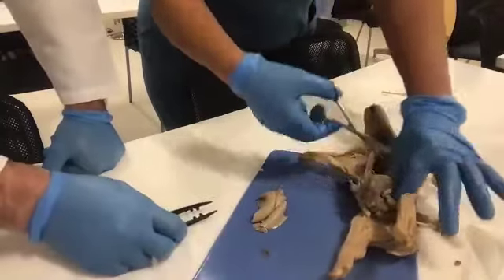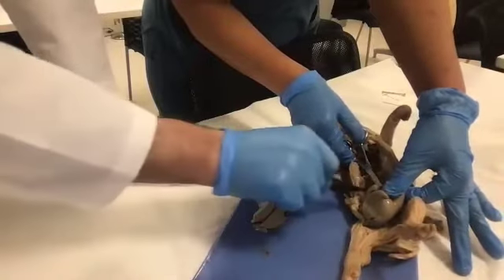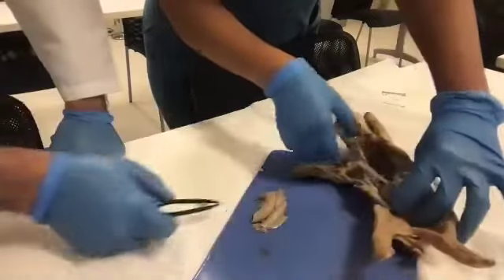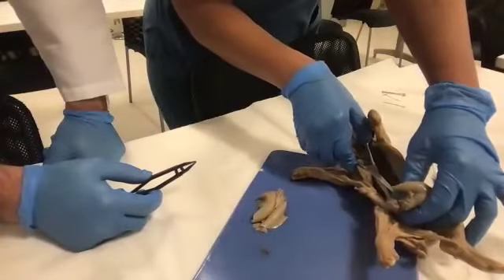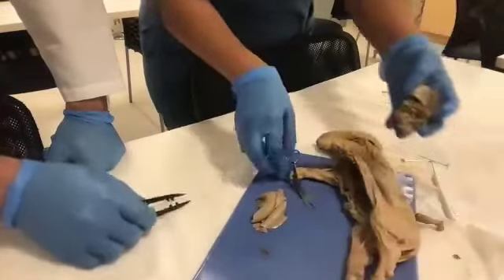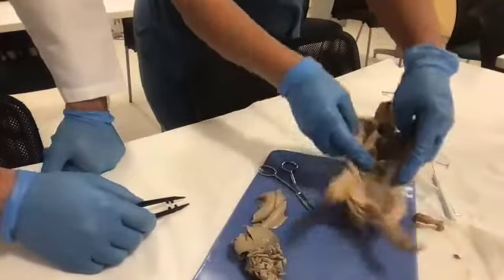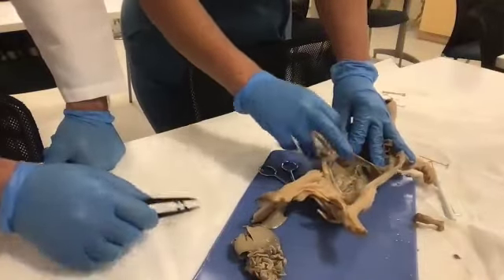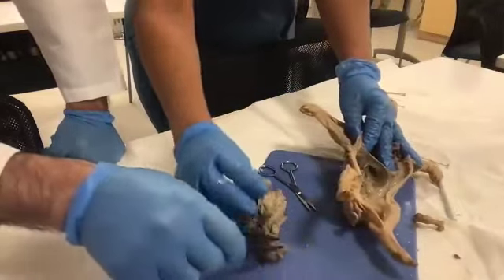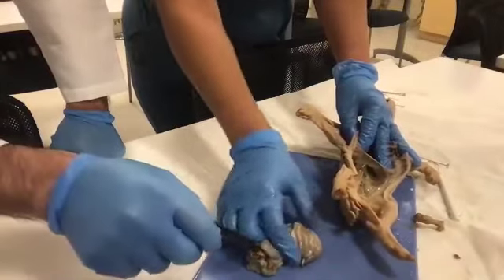I want to cut the liver and the kidneys. Into kidneys over here, yeah. So just leave them. Take out the large intestine, take out the small intestine, and take out the liver, and then we can look at it. Yeah, these are the kidneys. Another thing I would like to ask is, feel the consistency. How does it feel compared to lungs, compared to heart, compared to other things? It's the stomach, there's the intestine.